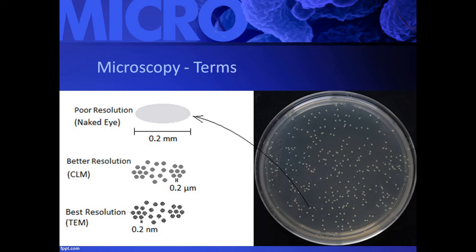Below this threshold, below this number, the naked eye or the microscope cannot make the distinction. It will merge all the points as one point, or even cannot see below that limit.